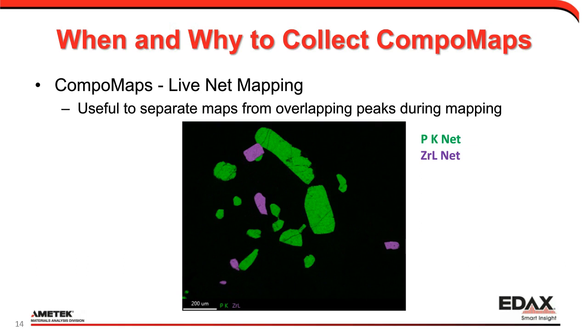And for those of you in the field of geology out there, and there were a bunch of you attending today, thank you, you probably agree. Phosphorus and zirconium probably do not make sense in a compound together. And so when we do this full deconvolution, sure enough, we could do the overlay and confirm it's either or, not in combination.